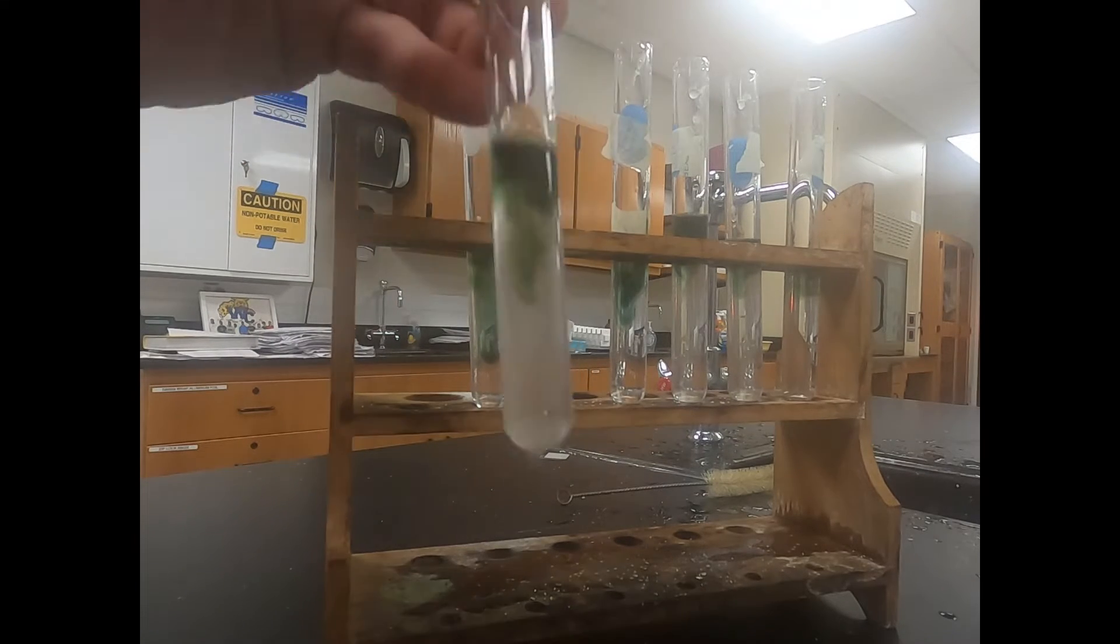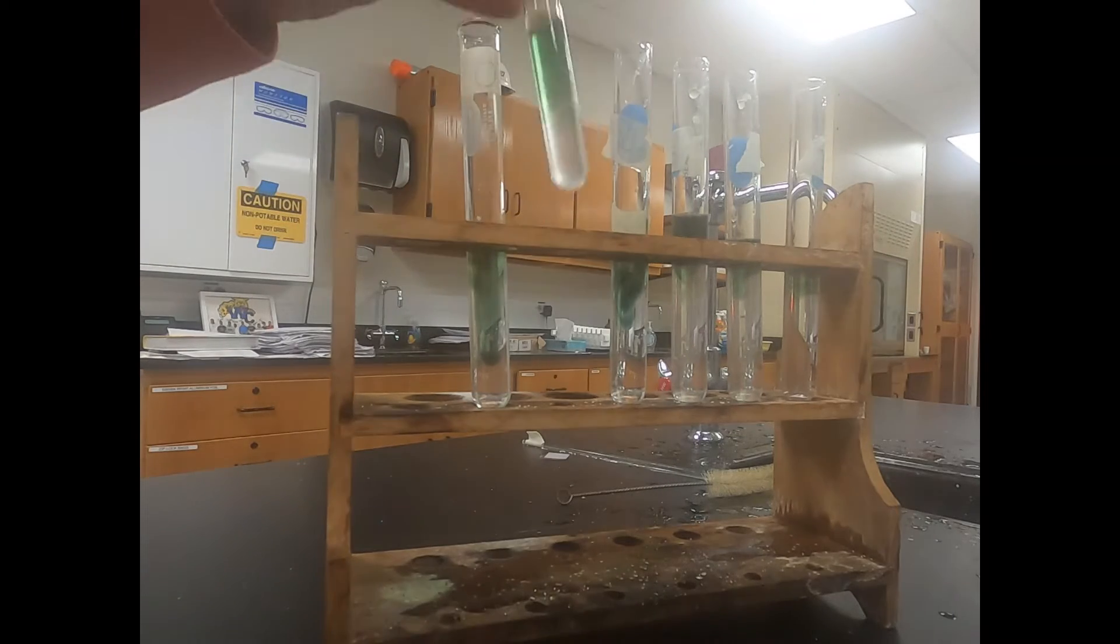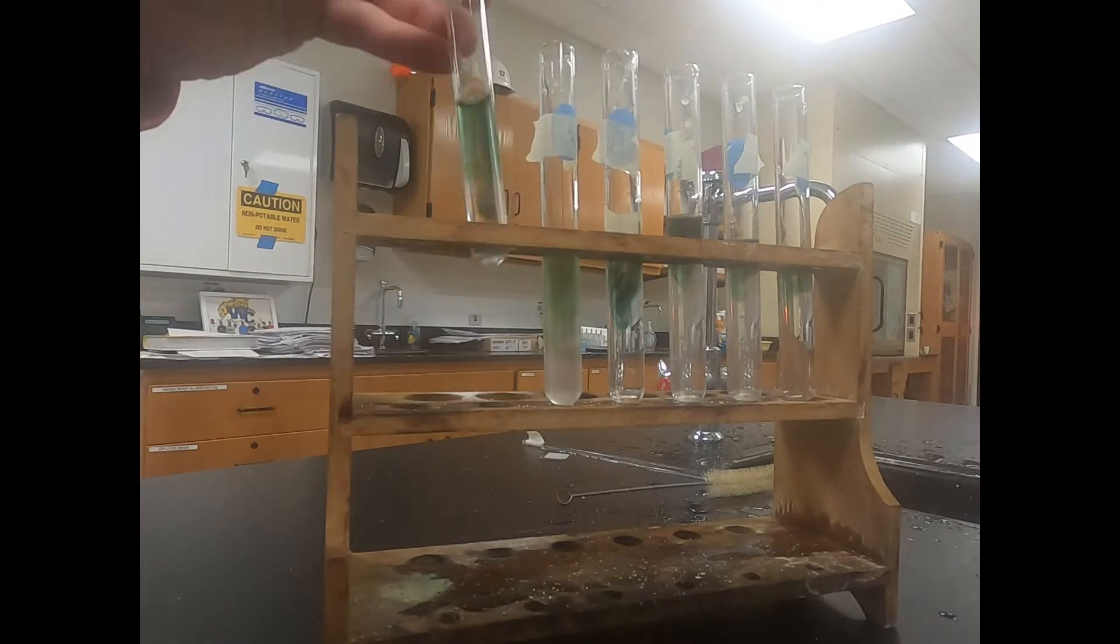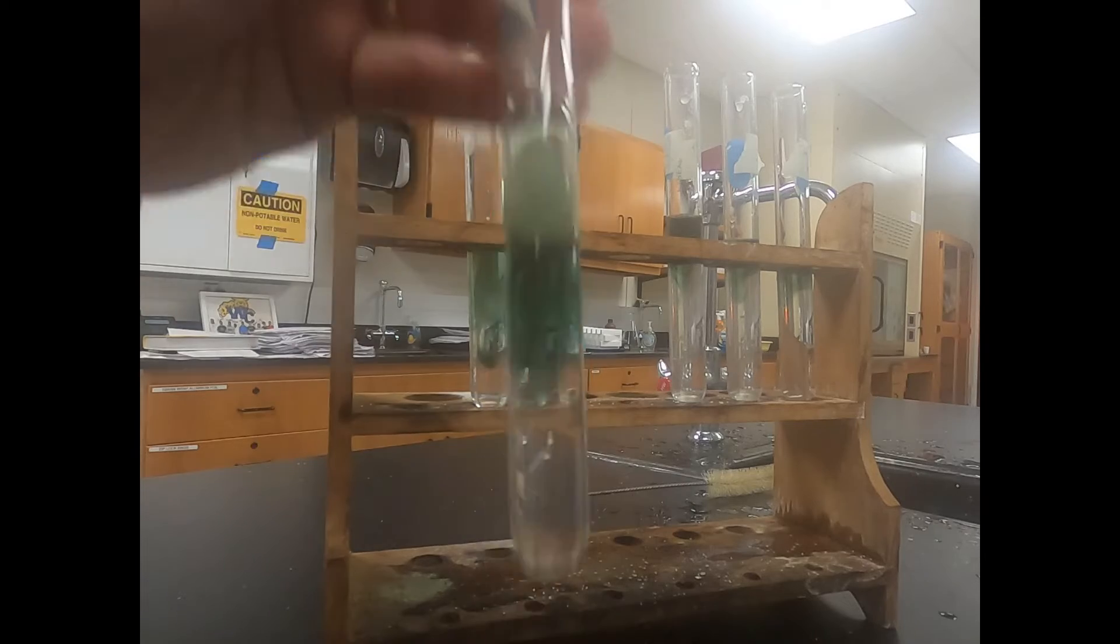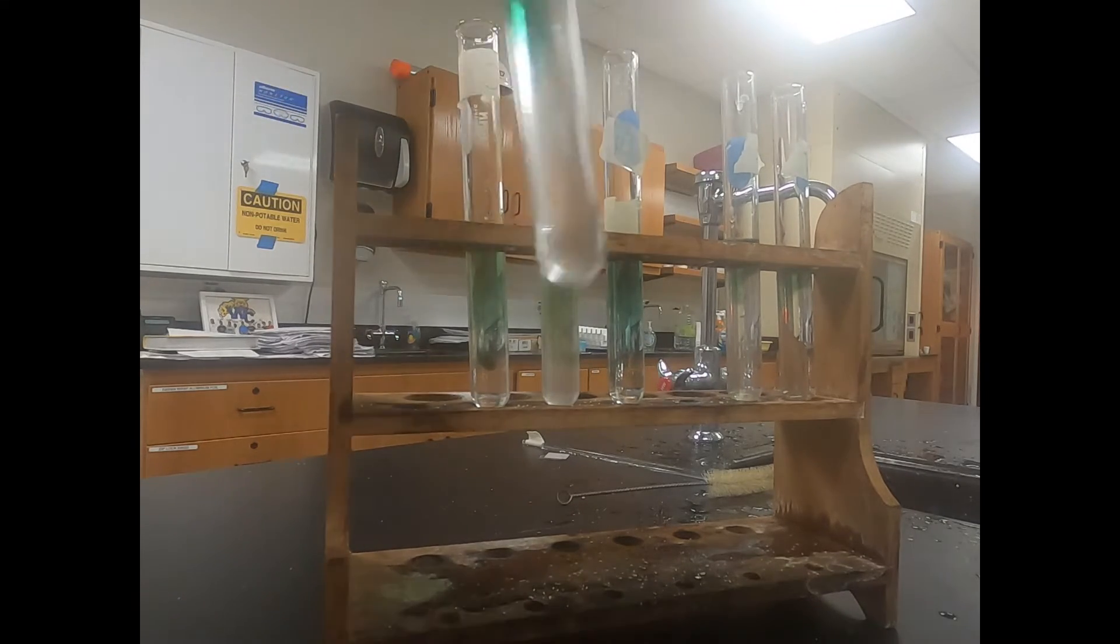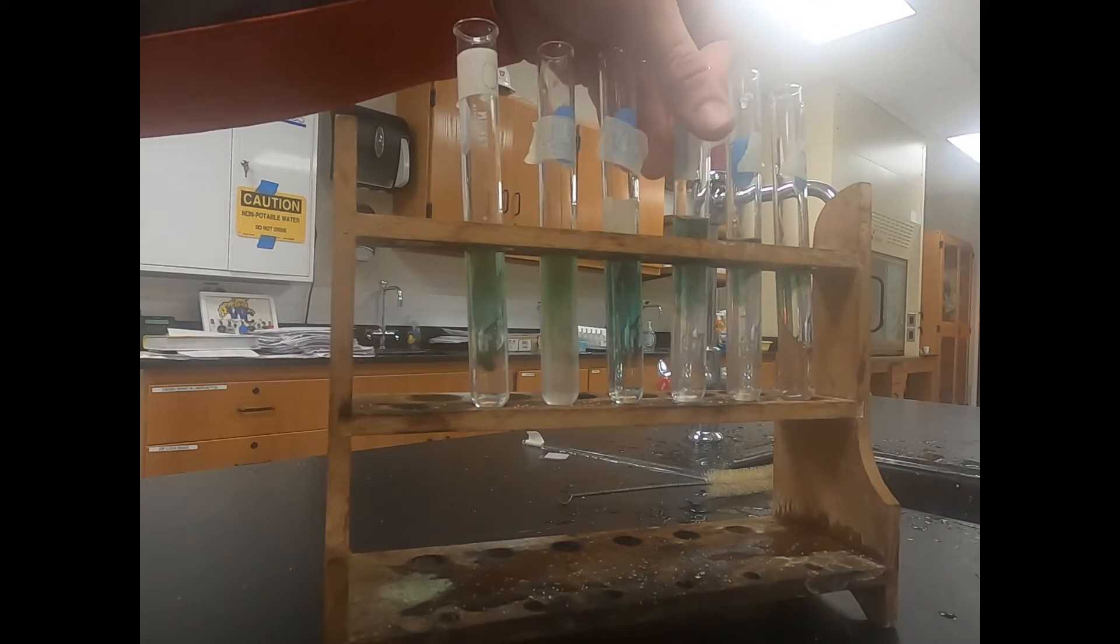Once you have the bromethyl blue added to each one of your test tubes you want to gently swirl it to mix it throughout that test tube. We're just going to gently swirl it to help it mix evenly. As we start weighing the yeast it should have some time to help diffuse throughout that test tube.